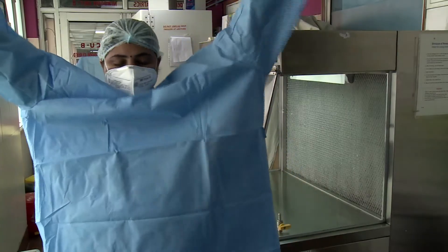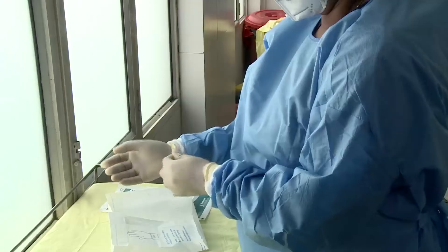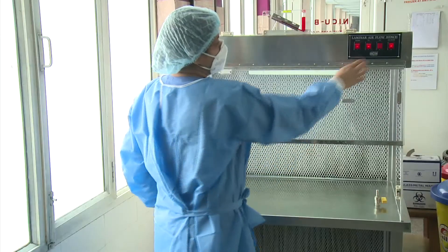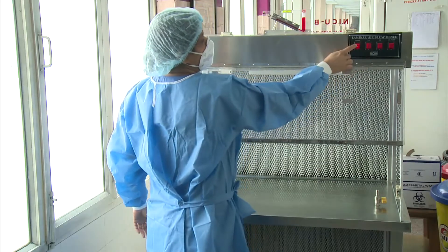Ensure strict asepsis by wearing mask, sterile gown, and gloves while preparing the medication. Switch off the white light and airflow after preparation of medication.